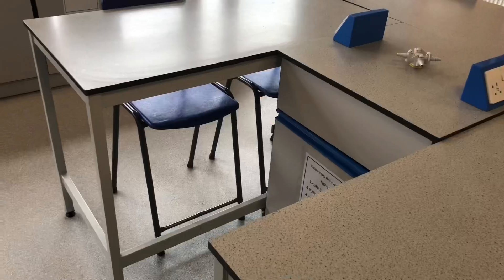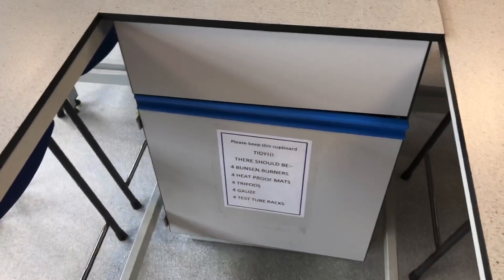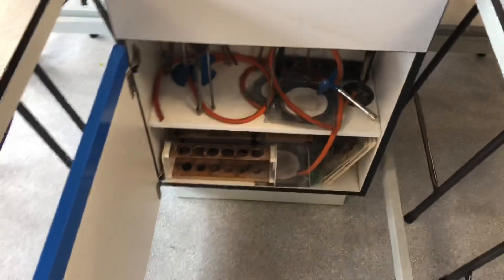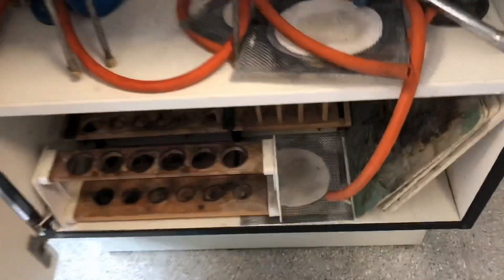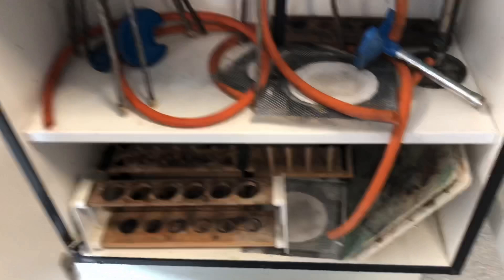So the next thing I do — if I'm working at this table — is come to my cupboard, open it up, and get out all of the bits of equipment that the teacher has told me to use. Today I'm going to take a heatproof mat — this protects the table — and I'm going to put my Bunsen burner onto that.